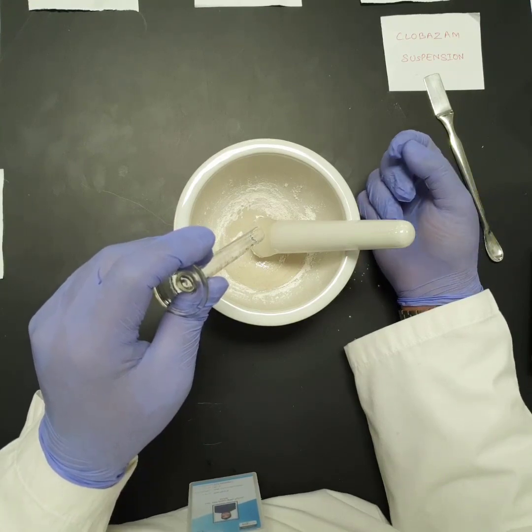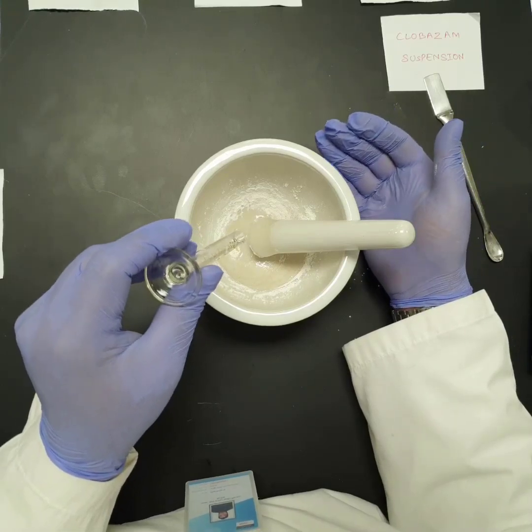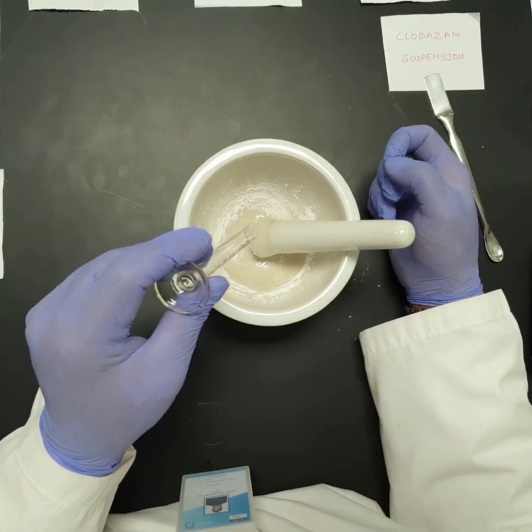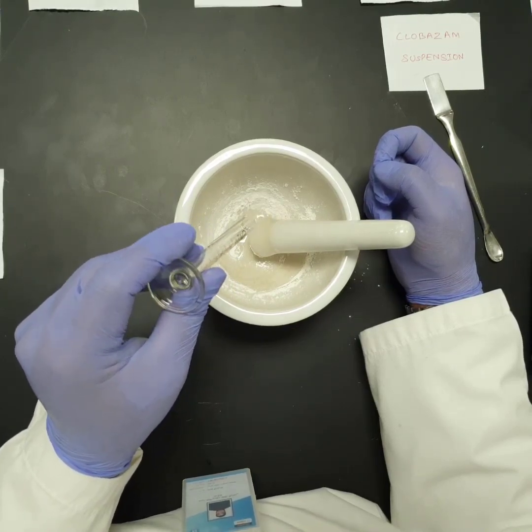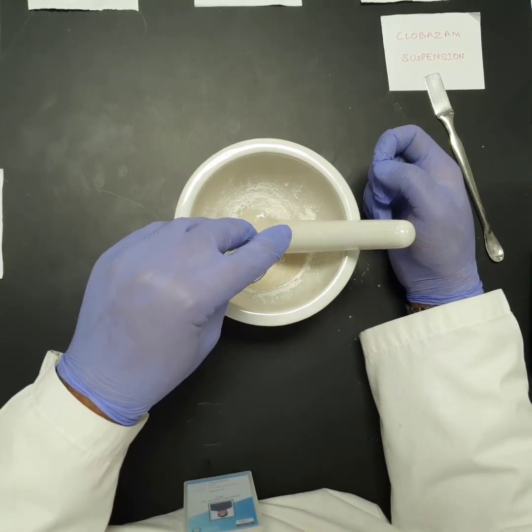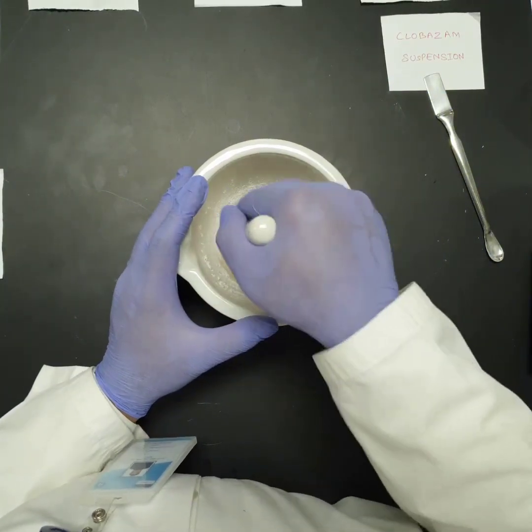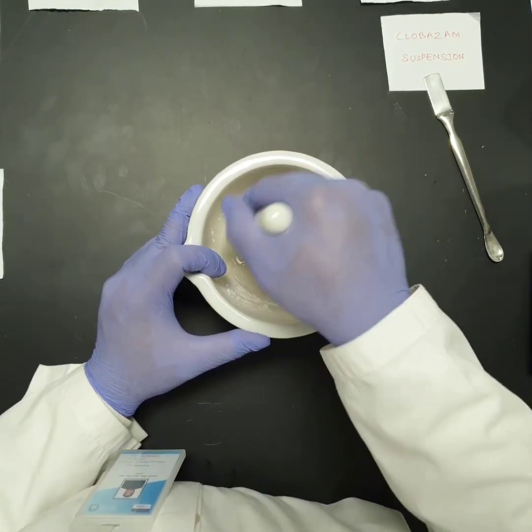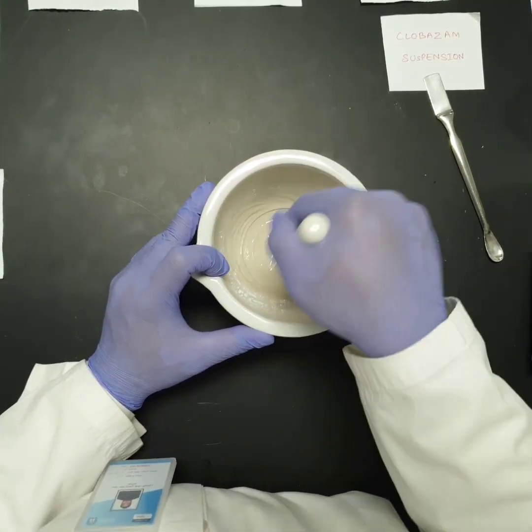Whenever you are transferring any thick or viscous liquid like oil, glycerol or syrup, you have to overturn the graduated cylinder and wait for some time until the last drop falls into the mortar. Now I think this is the last drop which is going to fall. So by this I have added all the glycerol, which is 3 ml. Now I am going to mix it to form a smooth paste. This will give me a smooth paste like a semi-solid.